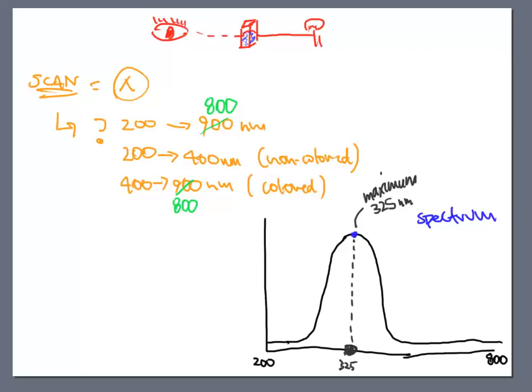And what the machine is telling you is that if you want to measure the sample, you need to dial in to 325, because that is the number that's the most sensitive for the molecule that you're running. That is the area of the buffet line that it really enjoys. And if you want to make this molecule happy and if you want to measure it, then this is the magic number that's going to allow that to happen for you.